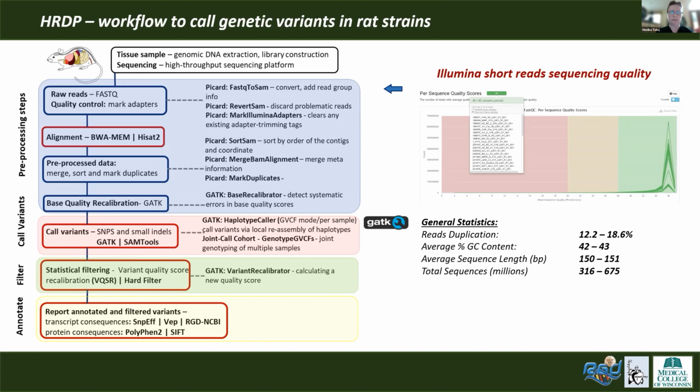But as we are using the GATK best practices analysis workflow, there is an optimization procedure in it, as this was designed for human population variant analysis, which usually has the problem with coverage too. So there are steps that are prepared for low coverage. We'll see how it will work.